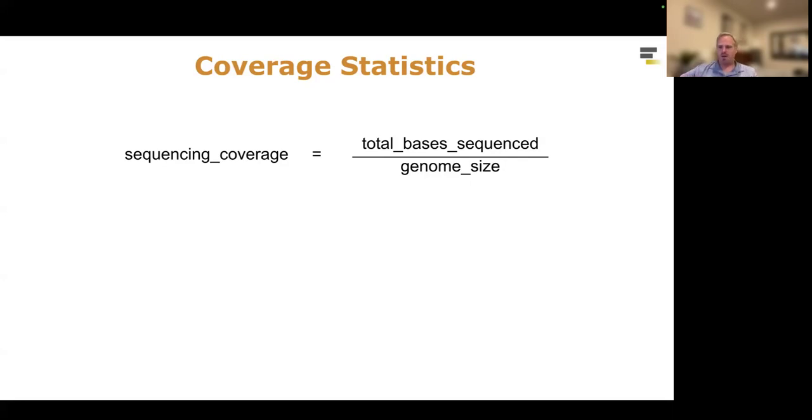So what's kind of interesting is there's a lot of information that you can get from raw sequencing data even before the assembly is done, including some estimates about the genome size, estimates on the accuracy of your sequencing, and a lot of estimates about repeat composition. There's a lot of good information you can get even from reads before you assemble them.